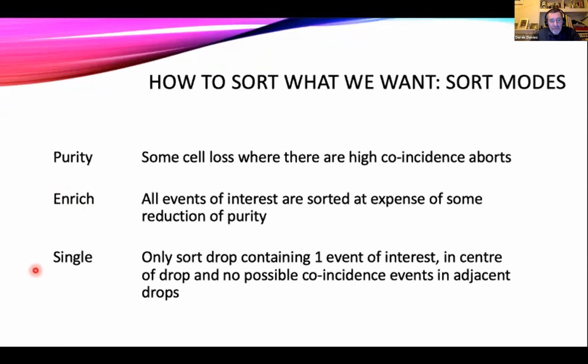And as I mentioned, single cell sorting is something that's really come to the fore recently. We've always been able to do it, but it seems to be that we're doing much more of it now. We're going to have a very stringent way of sorting because we really want to make sure that we have one cell of the type that we want. So we're only going to sort a cell when it's very well separated from any other cells in our sample.